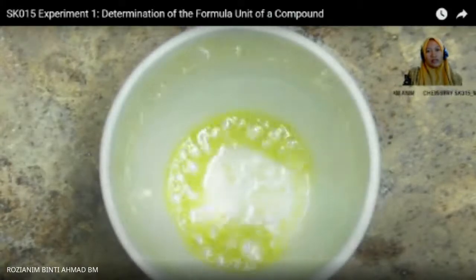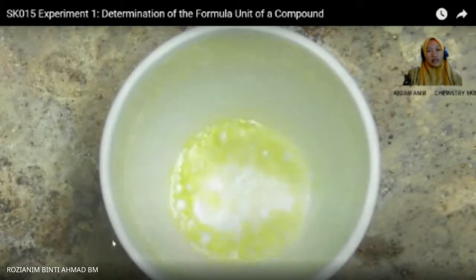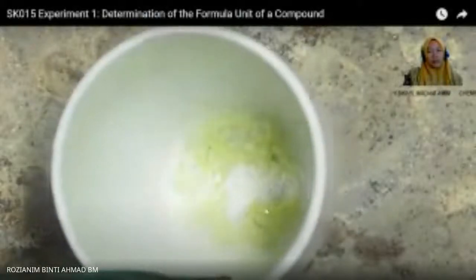So this is a process of cooling, this is a process of heating until we get the substance. So our substance should be solid.